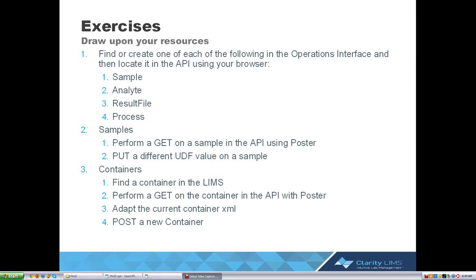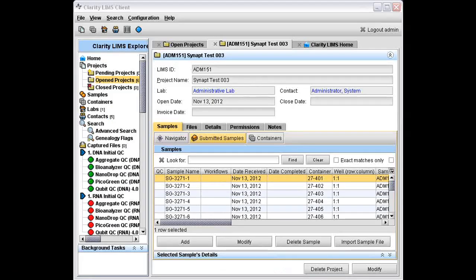Hello. In this video, we'll complete exercise one as listed here. Using the operations interface, we'll be finding some objects that already exist in the LIMS, and then we'll be locating them via the API just using the web browser and seeing what they look like there. Let's get started.